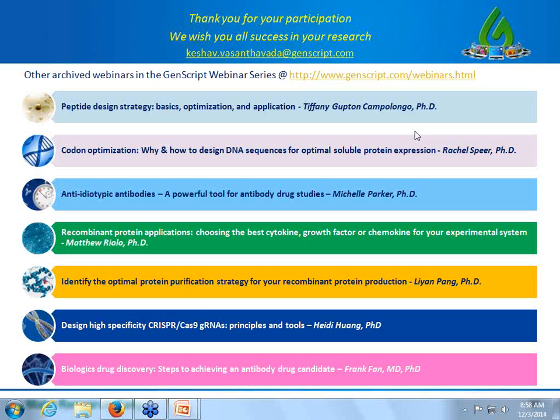By the way, on this note, you probably also know about foldases like DsbA, DsbC, PDI. They carry out various functions, but essentially they all work to accelerate any rate limiting steps along the folding process. And while co-expression works well, it's important to optimize the strategy just like with anything else, because not all chaperones work well with all targets. Also note that some chaperones can work really well as fusion partners.